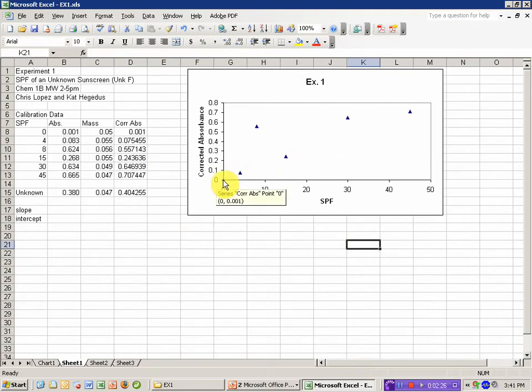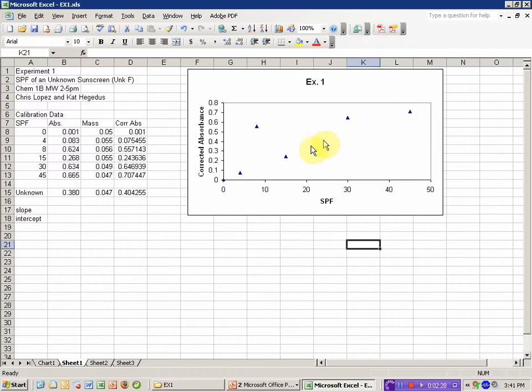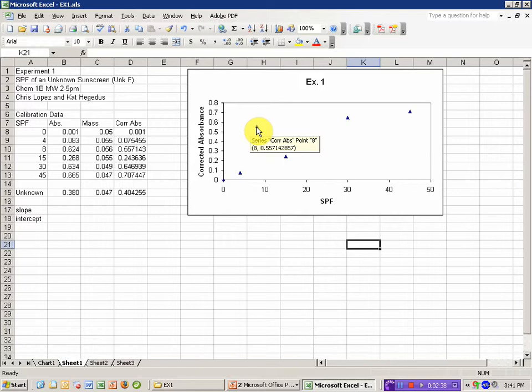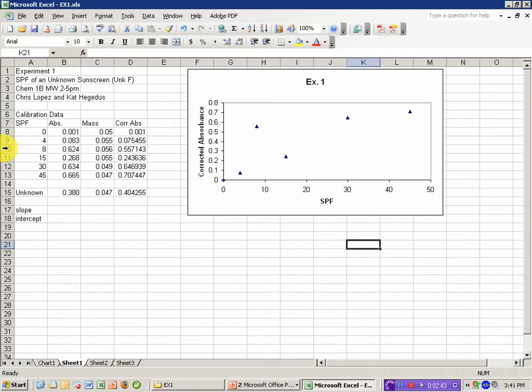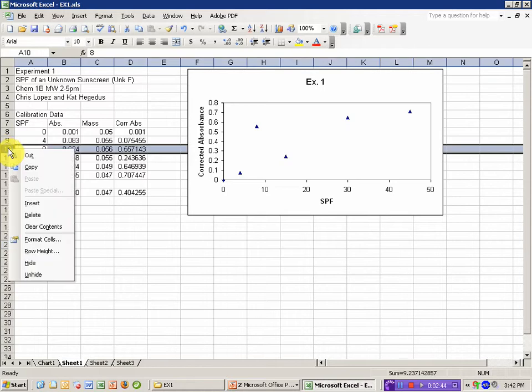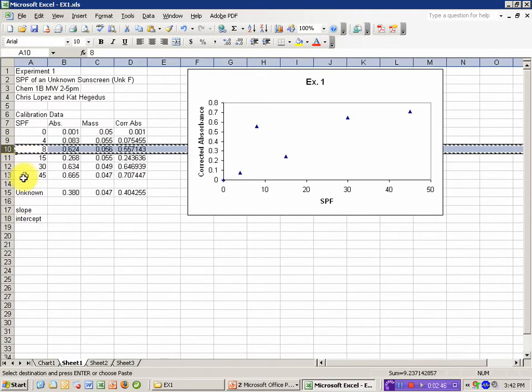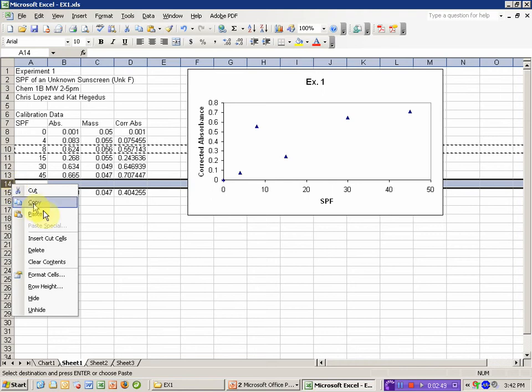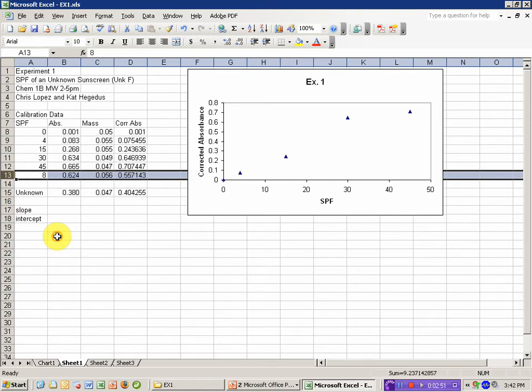For the most part, including the blank, this looks linear, but this data point doesn't seem to fit. As I move my mouse cursor over it, it tells me it's the 8 SPF value. So I want to include that in the plot, but not include it in the linear fit. To do that, I'm going to take this data, cut that row, and stick it at the end. And it will make sense in a minute why we did this.